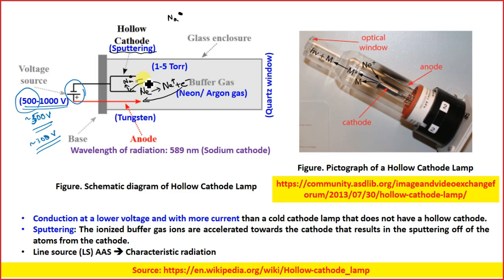Now they come out, and while they come out, they are at an unstable stage. They slowly start losing their energy, and during this process they come to the low energy state. See how I have represented a hollow circle.